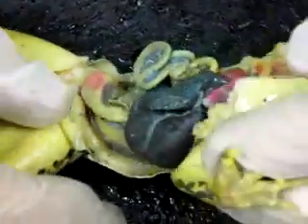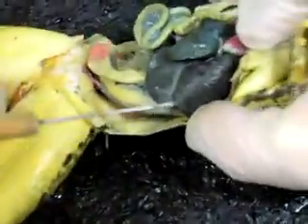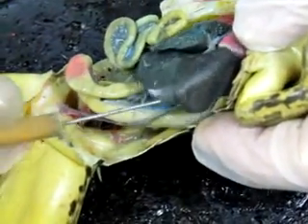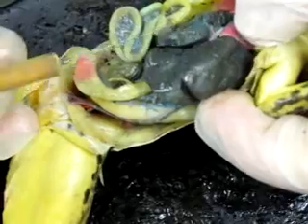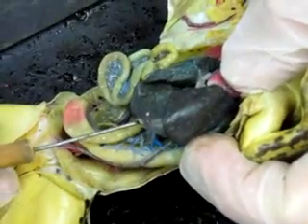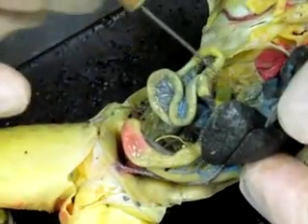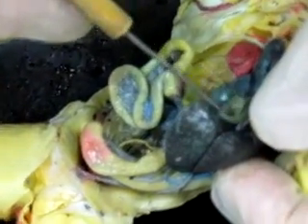Okay, now we're going to do the digestive system. We're going to start with the liver. Every frog has 3 lobes. We have a left lobe here, a right lobe here, and a median lobe here. Then in between these 3 lobes, there will be this little sac right here. That'll be called the gallbladder.